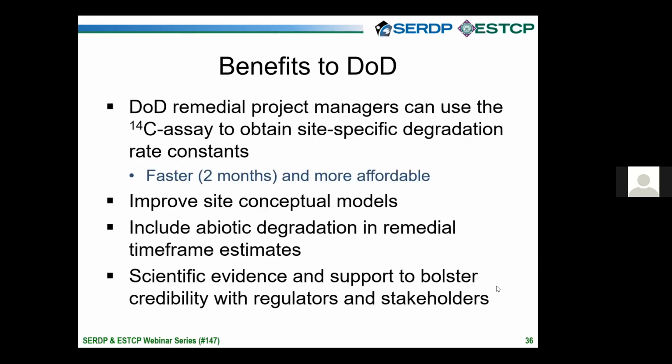So what does this all mean to DoD? I think the tools that we've developed with the C14 assay are going to give DoD remedial project managers a way to help assess site-specific degradation rate constants. The assay takes about 2 months and it's affordable. The results can be used to improve site conceptual models, especially if you have a hypothesis that abiotic processes are contributing to attenuation.